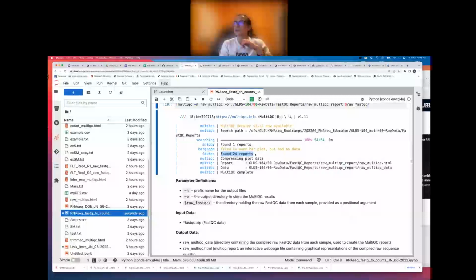For everybody, type in the chat. Yeah, 24 reports. Does that make sense? Why or why not? Should it have found 24 reports? Yeah. Why, Ty? You can unmute your mic.